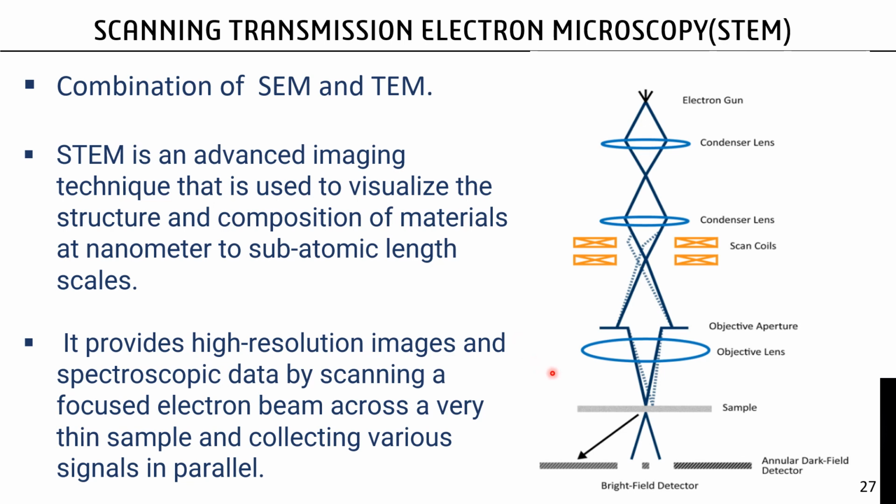Material prepared for STEM needs to be electron transparent, meaning it allows electrons to transmit through the sample with minimal scattering. This property enables a high number of transmission electrons to be collected by the different detectors, thereby improving the signal to noise. Typical STEM samples, including tissue sections, lamella, and nanoparticles on the order of 100 nanometers thickness or less, meet the criteria for electron transparency.